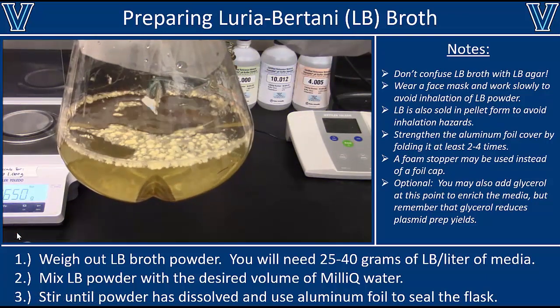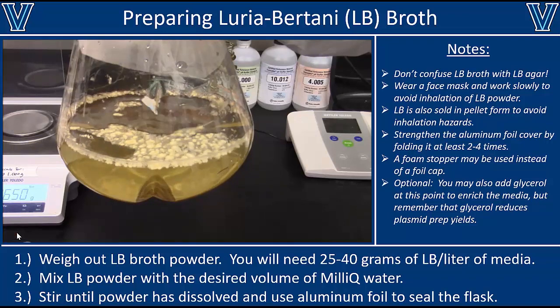I want to point out a few important things. Note that I'm making the media in the flask or container I'm going to be growing the cells in. The next thing I'm going to do is autoclave all of this, so by making the media in the culture container, I can simultaneously autoclave the vessel and the media. If I autoclaved them separately, I'd have to transfer the media, which creates a potential chance for contamination. So whatever culture vessel you want to use, put the media in it and autoclave the media in place.